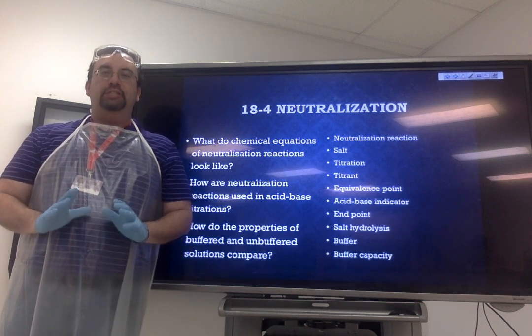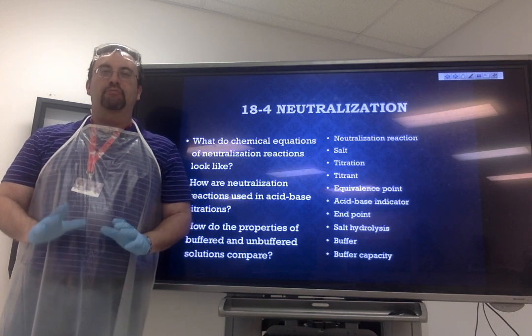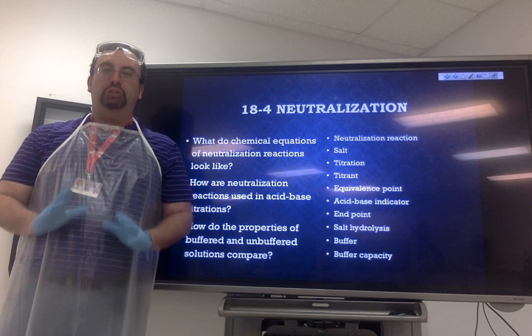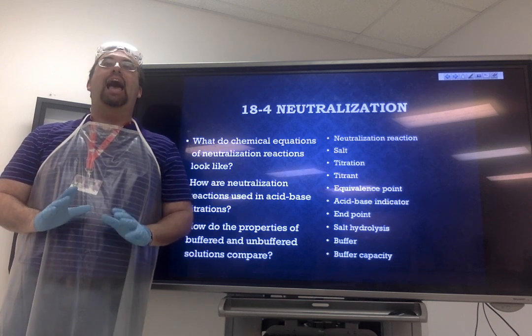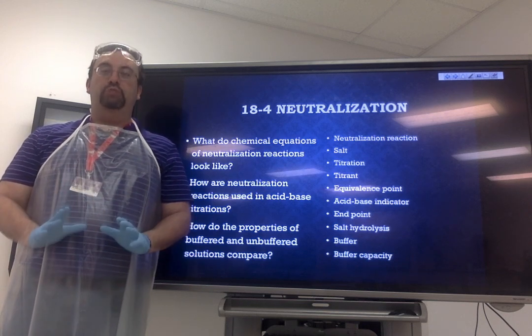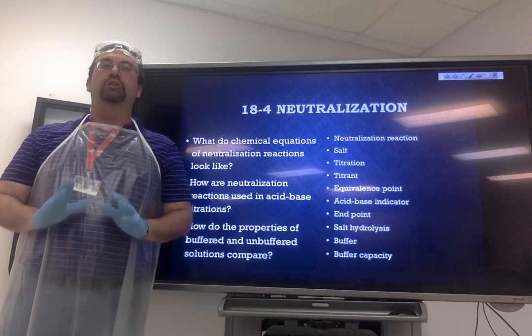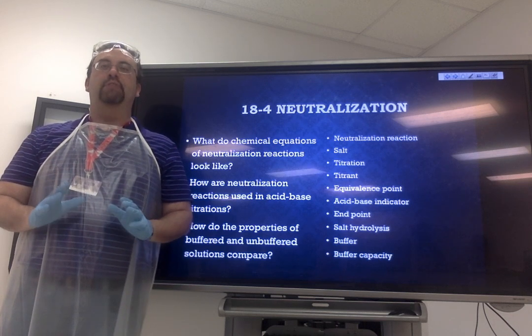In order to understand this last topic of the year, it's important that you guys have a proper demonstration. And so I'm going to show you guys how to do a very useful chemistry technique known as a titration in order to determine the concentration of an unknown solution.